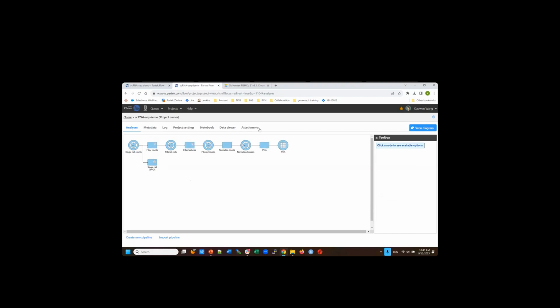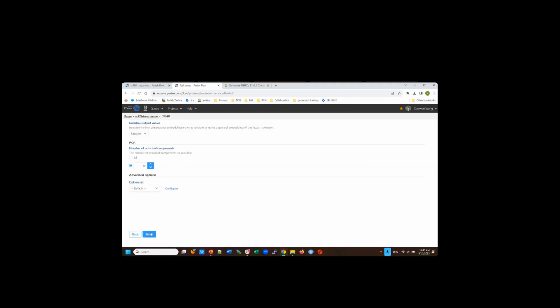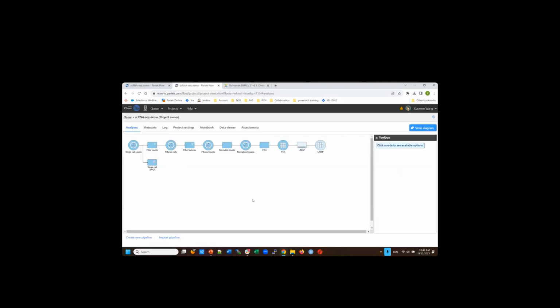So for single cell data, based on PCA, for exploratory analysis, people will look at the t-SNE or UMAP. You probably heard those terms. They are all dimension reduction techniques, mapping high dimension to low dimension. It's not a clustering method. It does not give you a p-value. Any judgment you make based on those plots is going to be subjective.